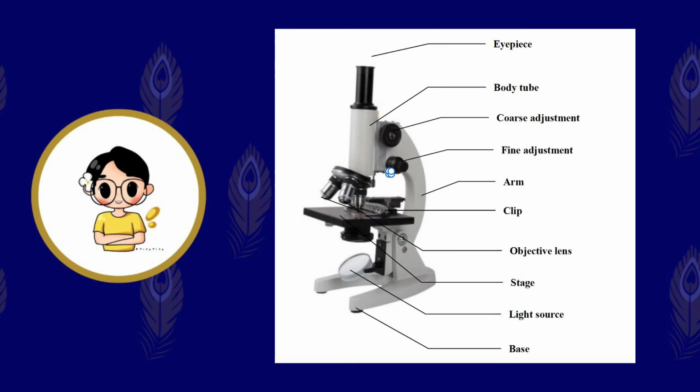Fine adjustment: we use it to raise and lower the stage, but more slowly, in a more controlled manner and at higher magnifications. Arm connects the eyepiece tube to the base. This is the part you should hold when transporting a microscope.